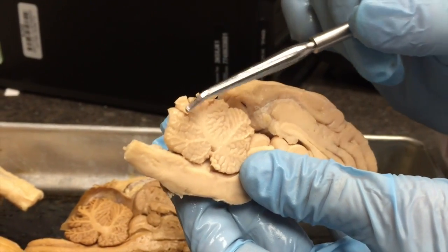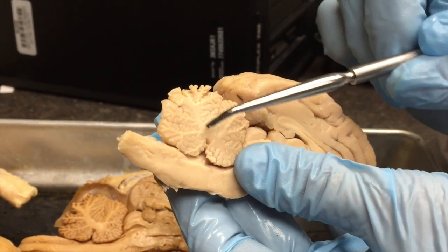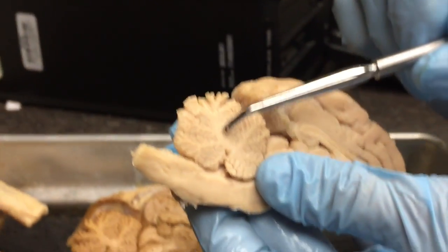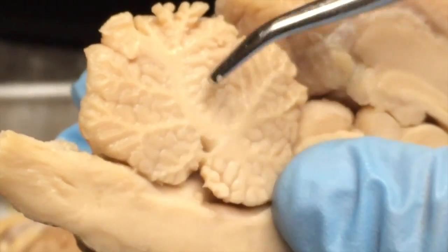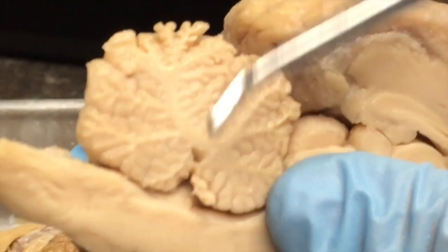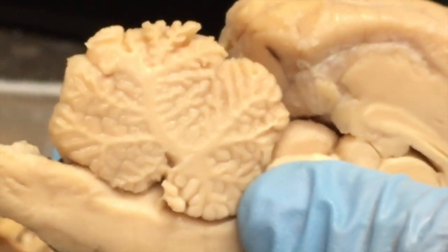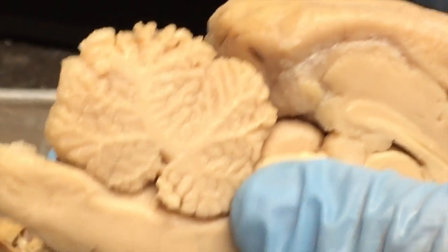And notice that the cerebellum has been cut, so you can see that there's an inner white matter known as arbor vitae. And the arbor vitae is the white matter of the cerebellum. It means tree of life, and so you can see the appearance of this structure is that it looks like a tree. So there's your cerebellum.